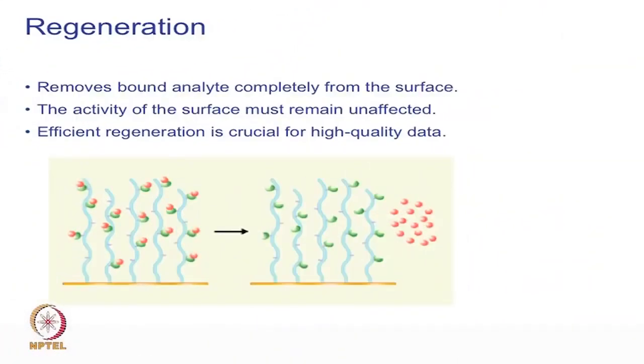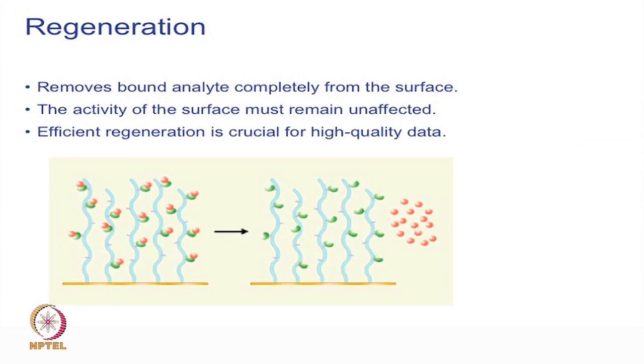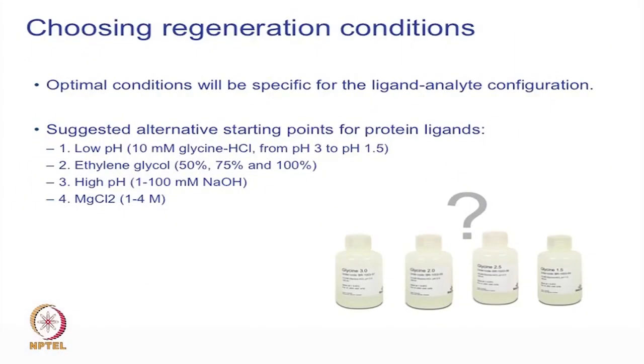Regeneration, as I just said, removes the bound analyte completely from the surface. The activity of the surface must remain unaffected after regeneration, and an efficient regeneration is crucial for high quality data. We need to test the regeneration conditions. We can do regeneration scouting before the start of an assay or while developing an assay, and then identify the appropriate regeneration conditions.